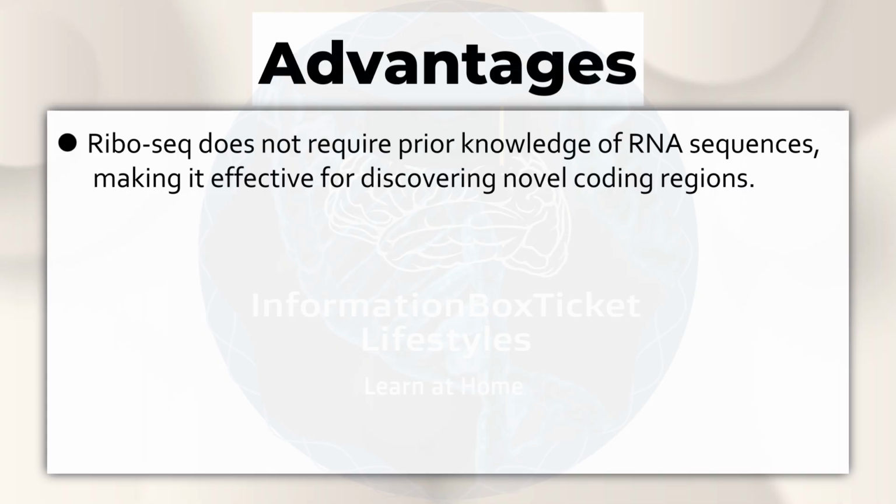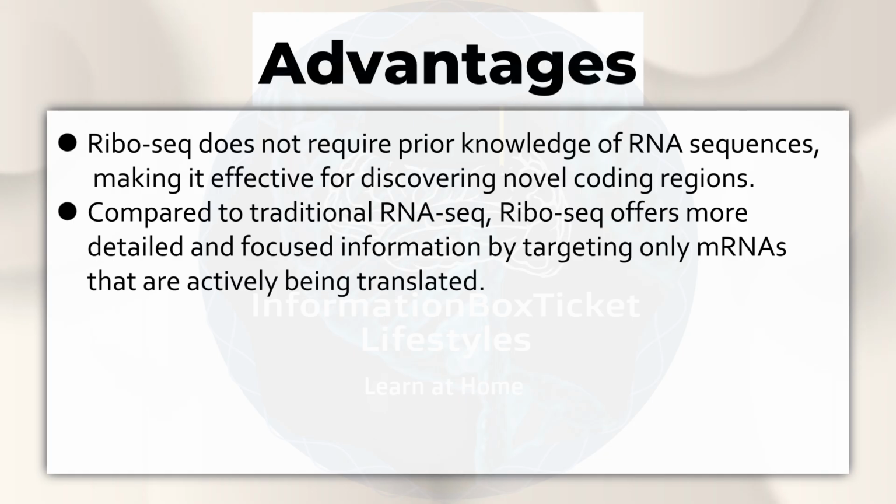Ribosome sequencing does not require prior knowledge of RNA sequences, making it effective for discovering novel coding regions. Compared to traditional RNA sequencing, ribosome sequencing offers more detailed and focused information by targeting only mRNAs that are actively being translated.